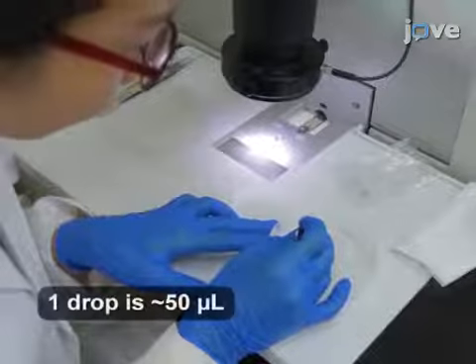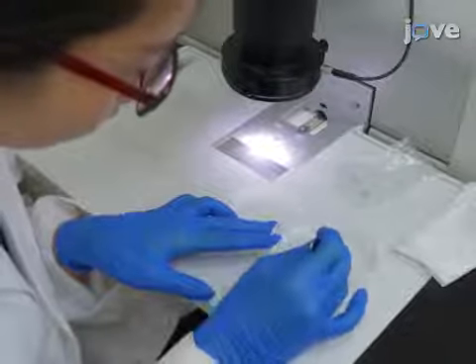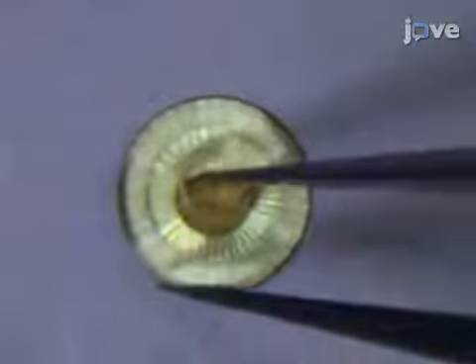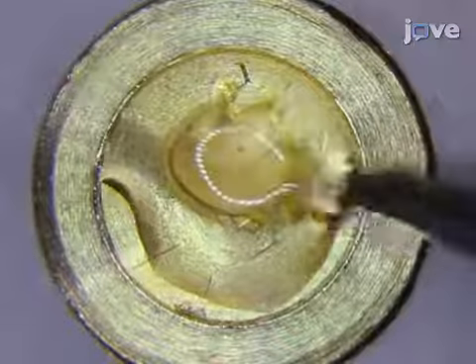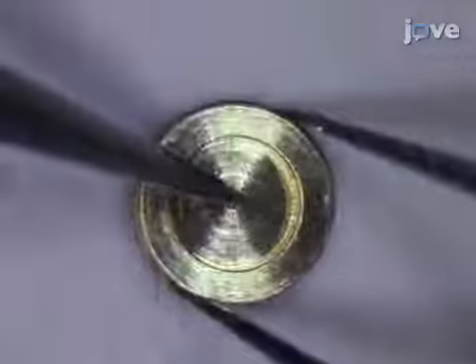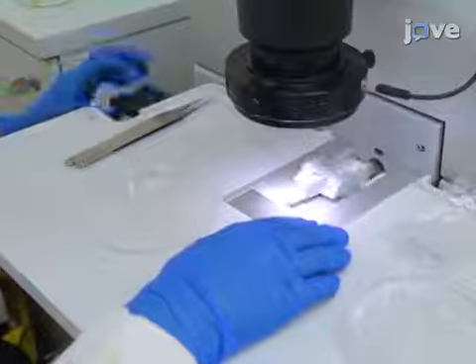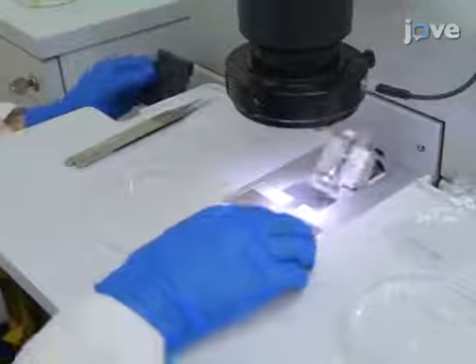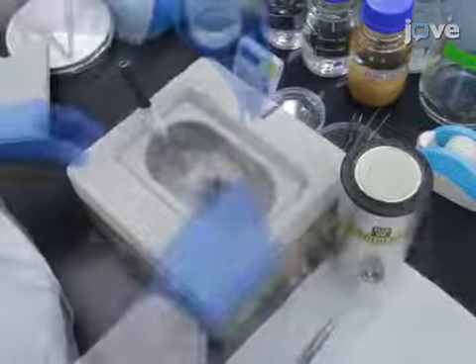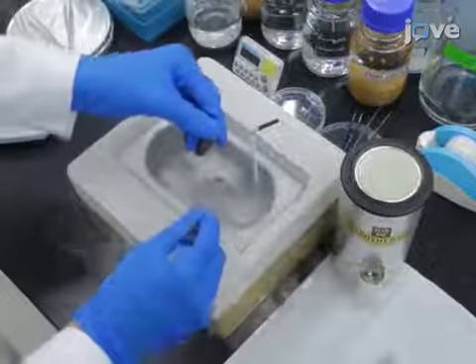Wash the tissue sections in 3 drops of phosphate buffer, then follow with a wash with 2 drops of phosphate buffer with 20% BSA. Place the sections in gold carriers for high-pressure freezing, or HPF, filled with buffer and 20% BSA. Next, load the sample containing the carriers into a high-pressure freezer according to the user manual. After freezing, release the carriers from the holder under liquid nitrogen and transfer them to a freeze substitution device cooled to -140 degrees Celsius.